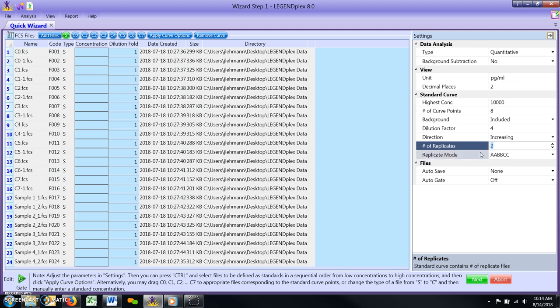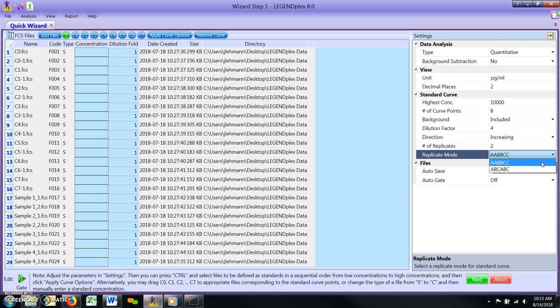Replicate mode. This parameter has two settings. AA, BB, CC, or ABC, ABC. The AA, BB, CC mode is for standard curve files arranged with replicates adjacent to one another, i.e. both replicates of C7 followed by both replicates of C6, etc.